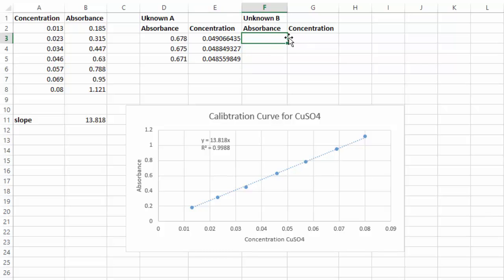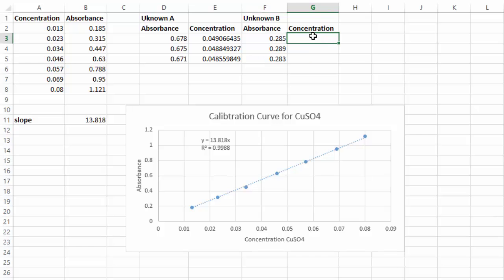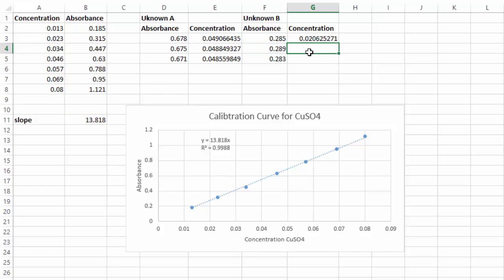For Unknown B's absorbances I have 0.285, 0.289, and 0.283. The calculation is still the same — I take equals, my y (absorbance), divided by my slope (M). That tells me my concentration. I'll do that two more times for the other values.